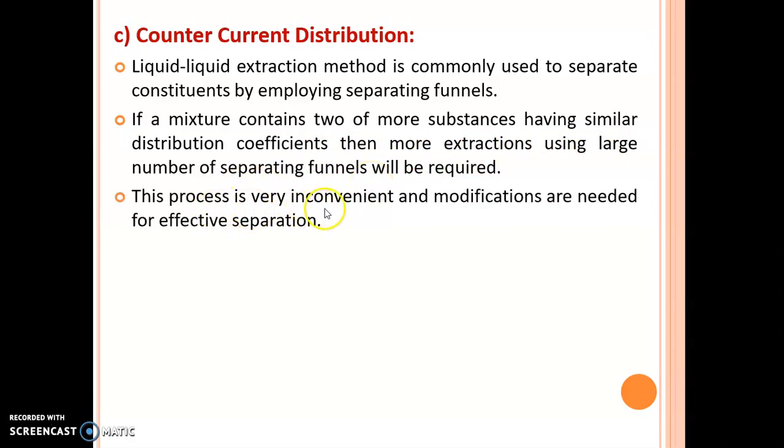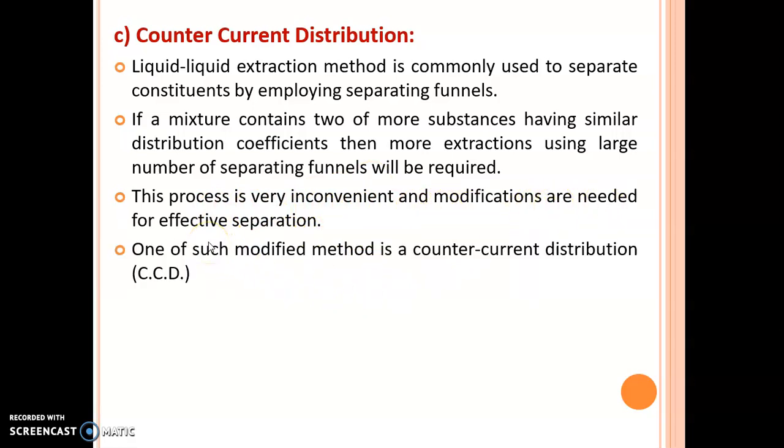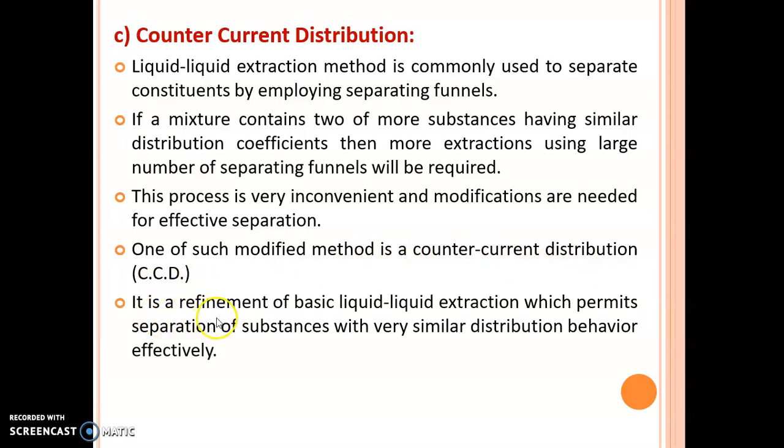This process is very inconvenient and modifications are needed for effective separation. One of such modified methods is counter current distribution, which is denoted by CCD. It is a refinement of basic liquid-liquid extraction which permits separation of substances with very similar distribution behavior effectively.